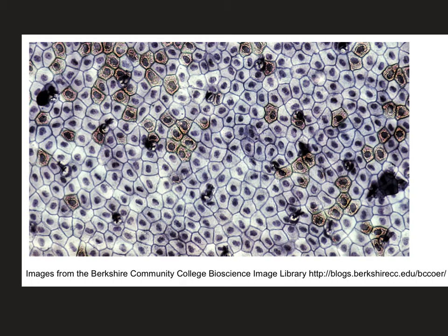If I was to examine this I would say there are single cells that are next to each other and the cells are fairly small. You can tell this simply by the size of the nucleus, the look of the cells, and if you know the magnification that would help as well. These cells are small, tightly packed, and appear to be in a single layer. In fact this would be an image of frog skin, which is a simple squamous epithelial layer — single cells each with single nuclei right next to each other.